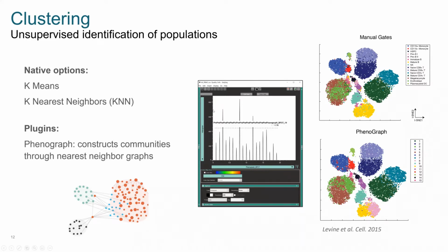Okay, then it's up to you as the researcher to look into these clusters and figure out what makes them unique and which ones might be of interest to you because they're of a higher frequency in one sample or another. Okay. So the power of clustering can be illustrated in this publication that describes Phenograph, which is one of our clustering options in the form of a plugin.